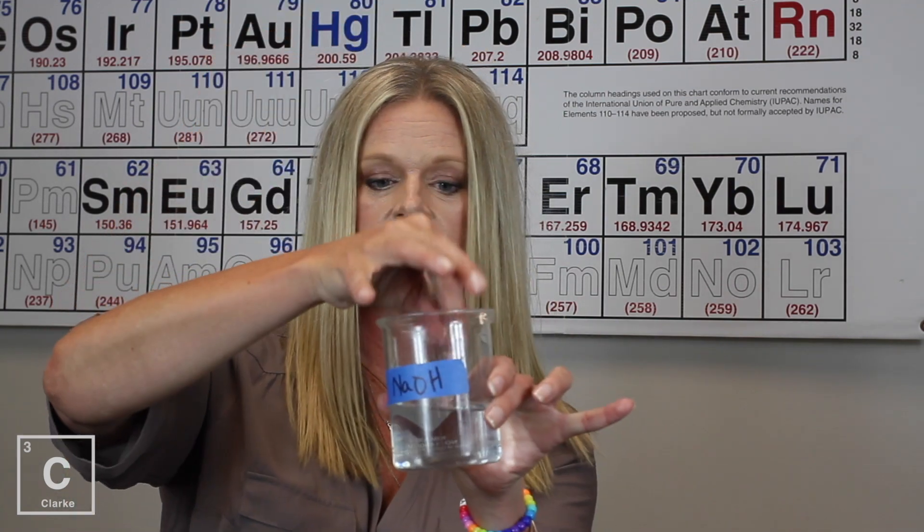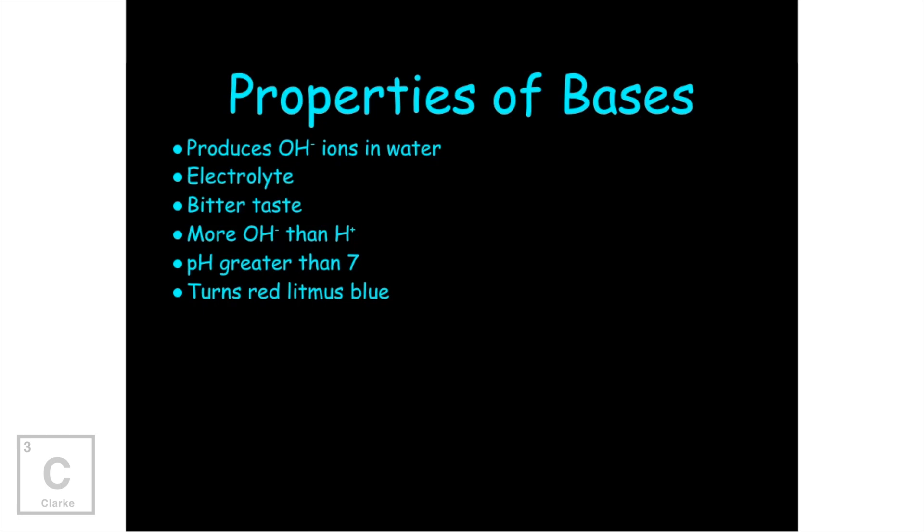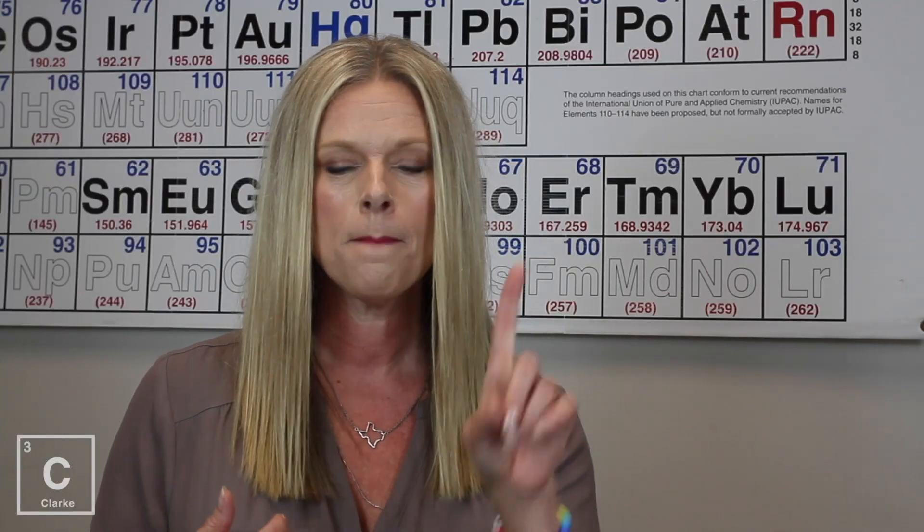Okay, let's talk about our litmus paper again. Bases are going to turn red litmus paper blue. So I've got my red litmus paper. I'm going to dip it in my base. Sure enough, it turns it blue. I've got my blue litmus paper. It just stays blue. A blue litmus paper is going to show a positive for acid, and a red litmus paper is going to show positive for base. But it's always good to dip both of them to have that confirmation. So bases, the blue litmus paper is going to stay blue. The red litmus paper is going to turn blue. I always remember B blue base.